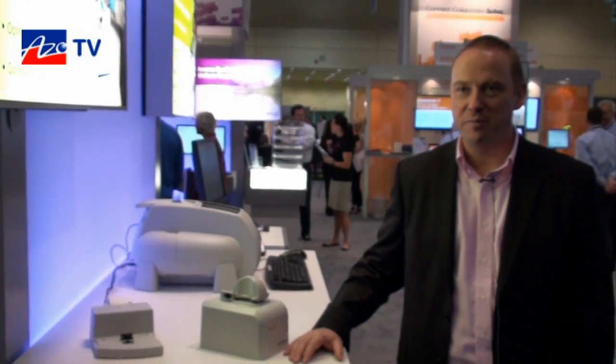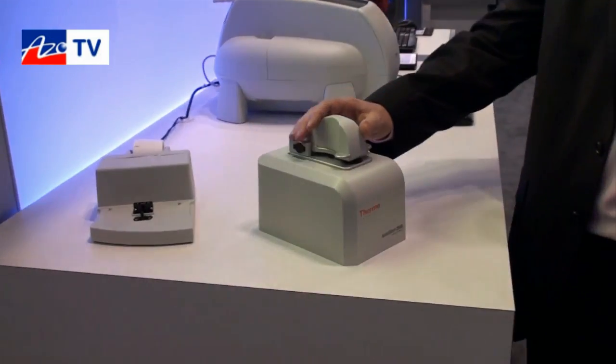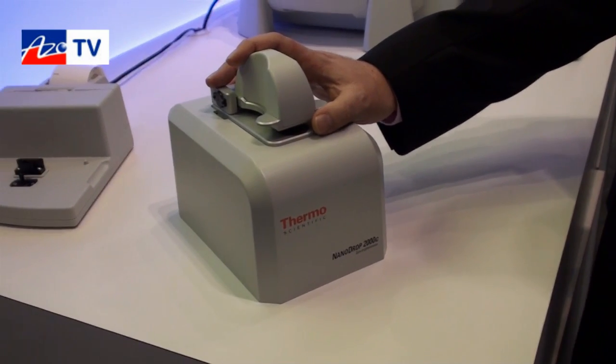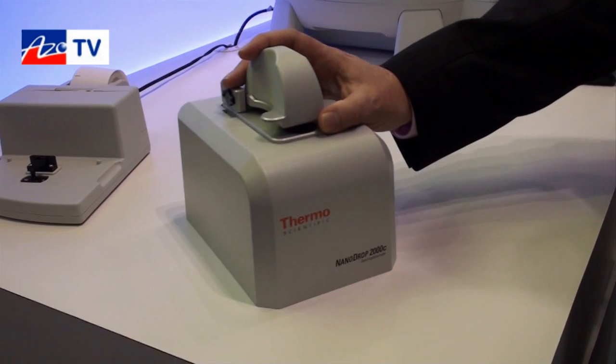Thanks Cameron. The NanoDrop Lite is the latest instrument in our NanoDrop series of UV-Vis spectrometers. What we're known for is the NanoDrop 2000 with its micro-volume sampling capability — a very popular instrument for the quantification of DNA and proteins.